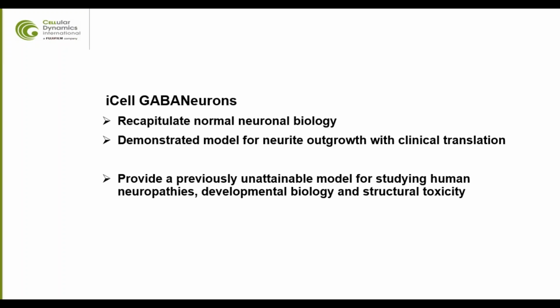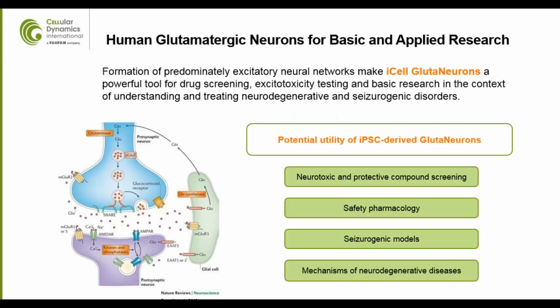All right, that part all dealt with the structure of the neurons. Now we're going to look at electrical excitability. And again, I'll give a brief overview, and Dr. Bader will actually take a deeper dive into how one can do the analysis of really a complex biological phenomenon.